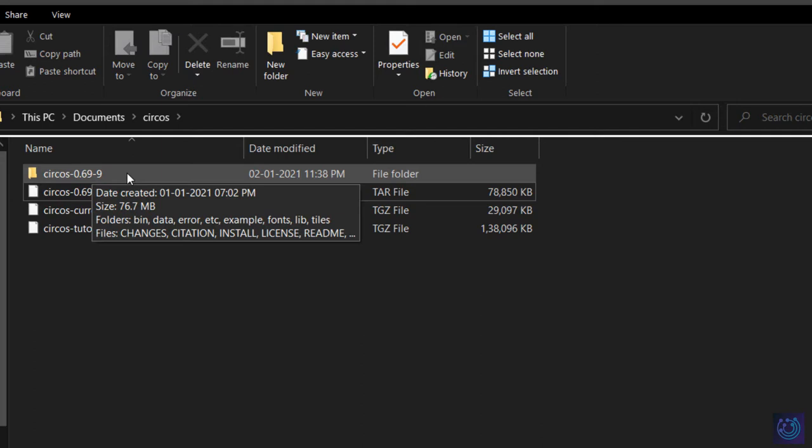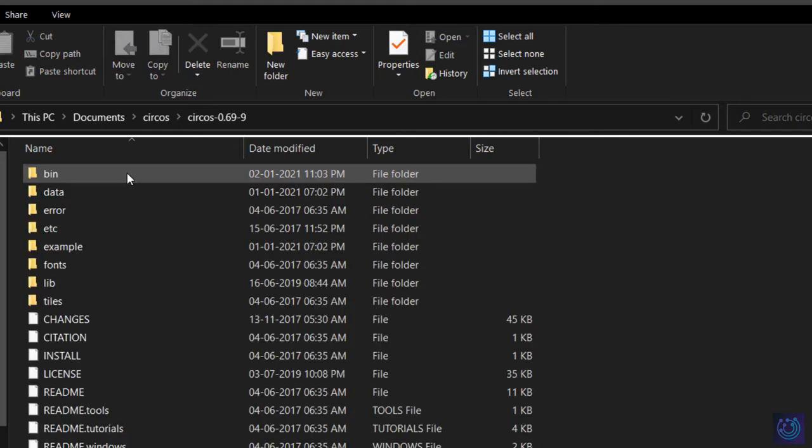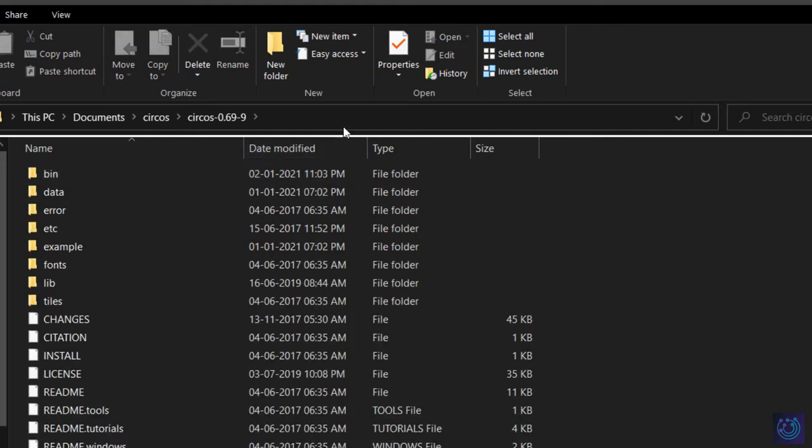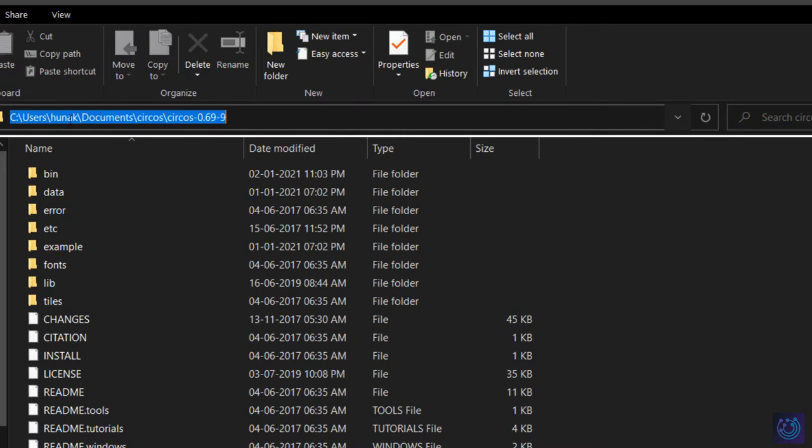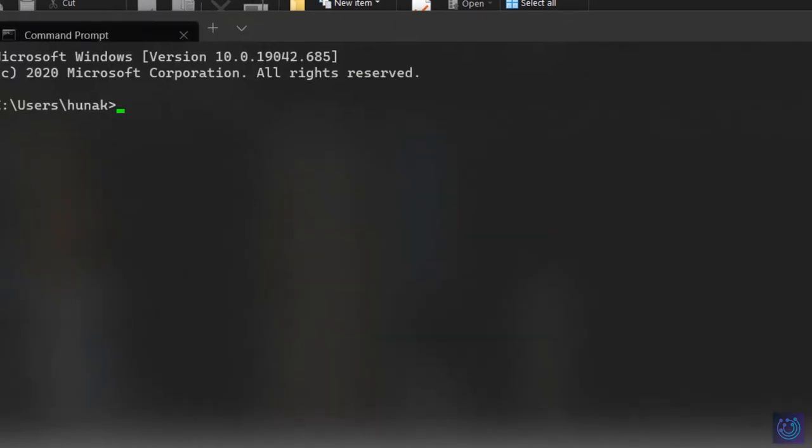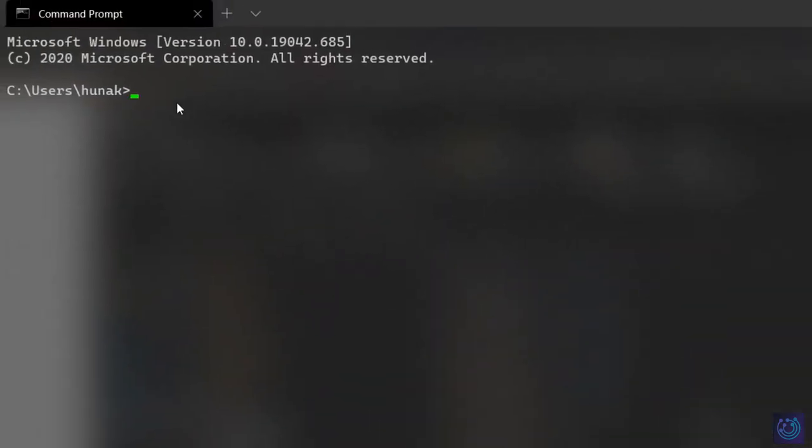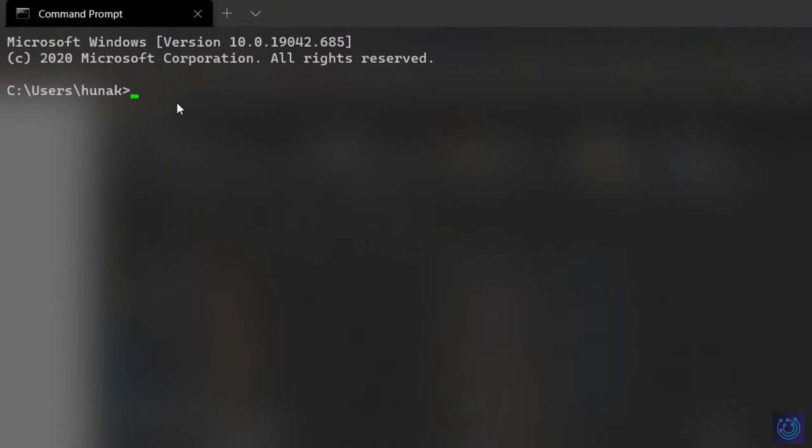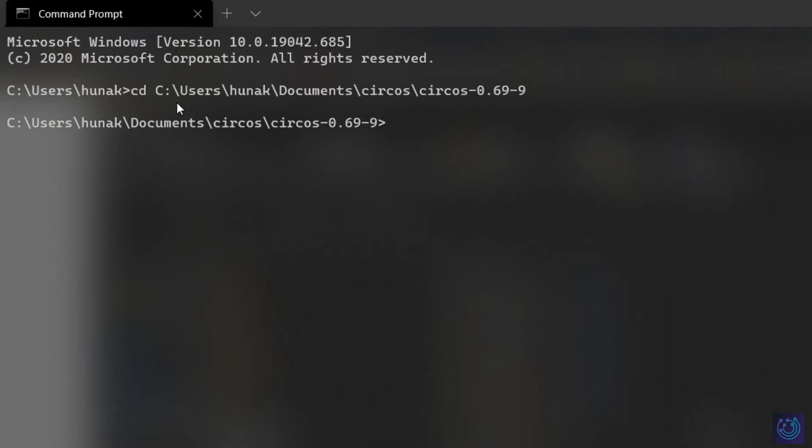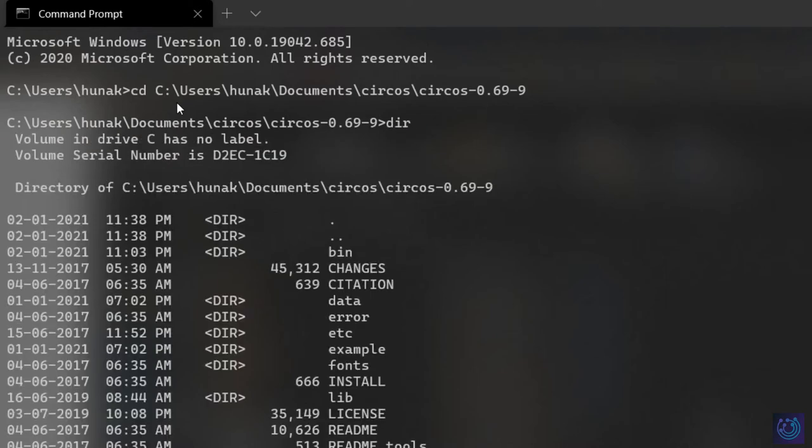Now go into this folder, copy this path, and open your terminal. In the terminal, type in CD and enter the path. After this, hit enter. Let's check the content of this file with DIR.